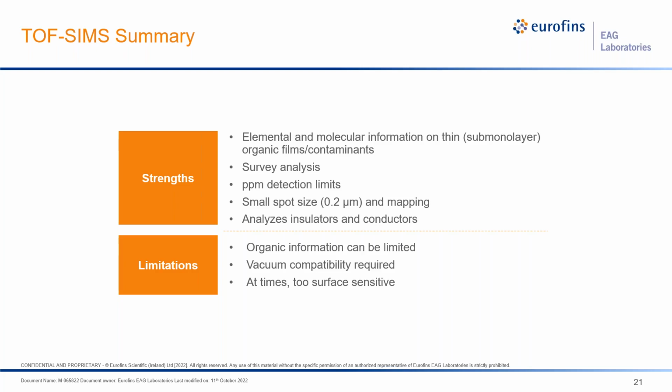And what this is referring to is if you have a feature of interest and then somebody handles it or throws it in a bag that's full of plastic slip agent, and then we try to analyze it, all we'll see is the contamination on top of your feature of interest. And that is often an issue.